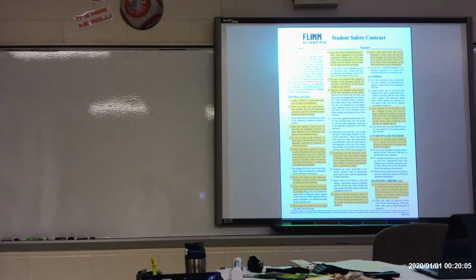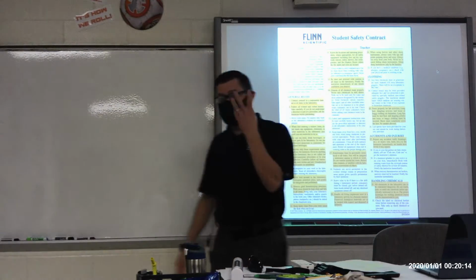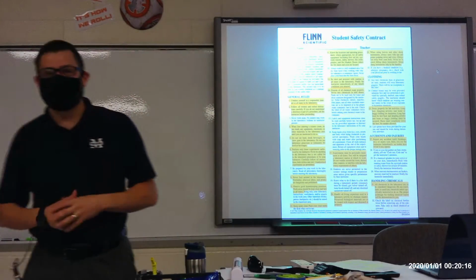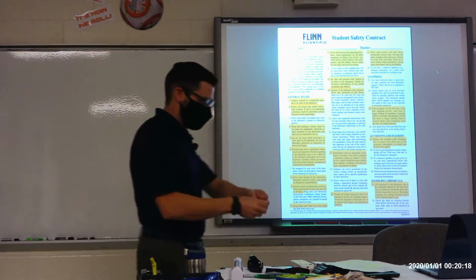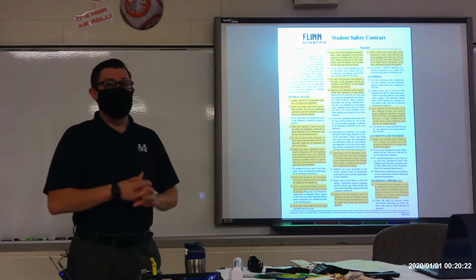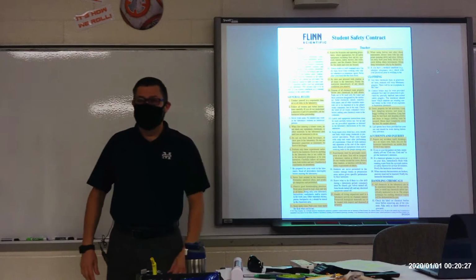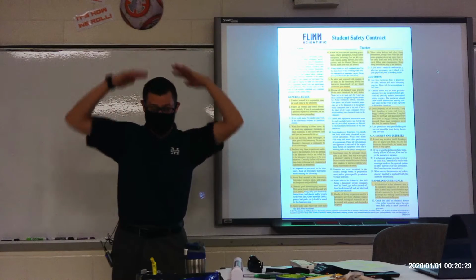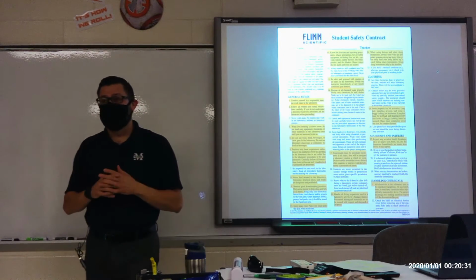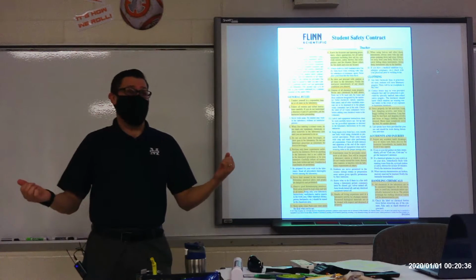And I've had a student have to use the eye wash station before. We were doing a dissection and it wasn't really anybody's fault, but the preservative in the dissection specimen is mostly alcohol-based, and it squirted up and got in her eyes. It didn't feel pleasant, so she had to come up and use the eye wash station, and it splashes quite a bit. So when she was done, she was soaked from here down, and everybody was like, "Whoa, you're soaking wet," and she was like, "I don't care, that hurt."